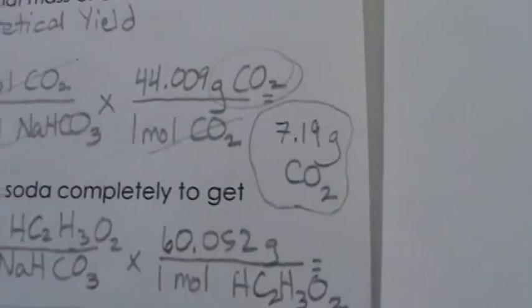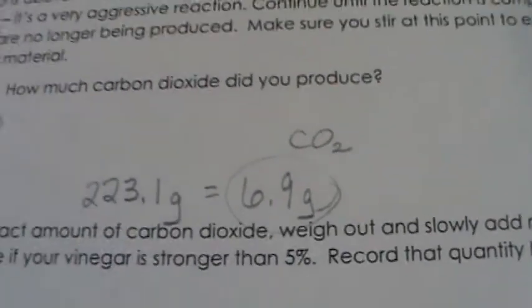So that means that I'm a little bit low, which makes sense because remember we talked at the beginning about that. Maybe I went too quickly, and I'm going to continue to agitate it for a bit. Perhaps there's still some carbon dioxide in solution. I'm trying to get the carbon dioxide to come out of solution, sort of like if you leave a soda lying around for a day and then you come back and it's flat.